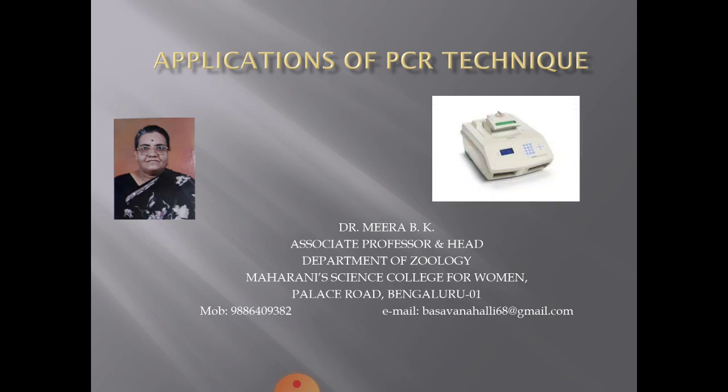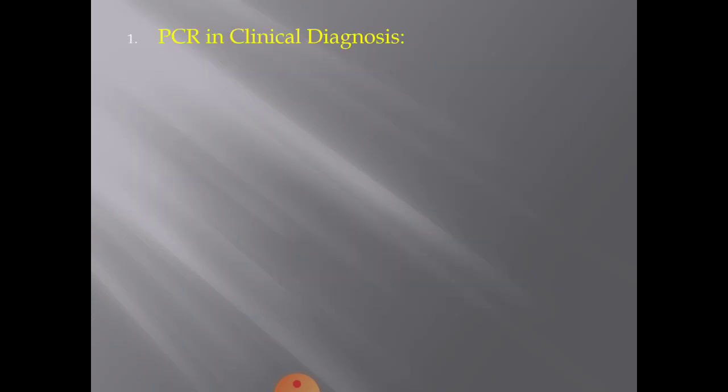And this is an automated machine of PCR. Now we shall study the applications of PCR. Some of the applications of PCR can be briefly discussed like this. First one is PCR in clinical diagnosis. That means applications in medicine.